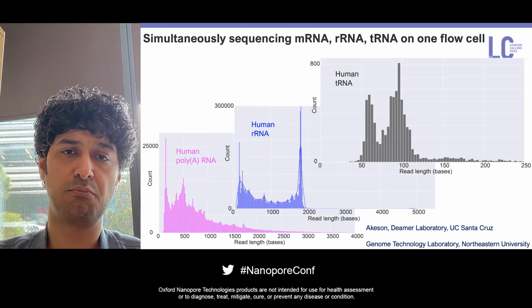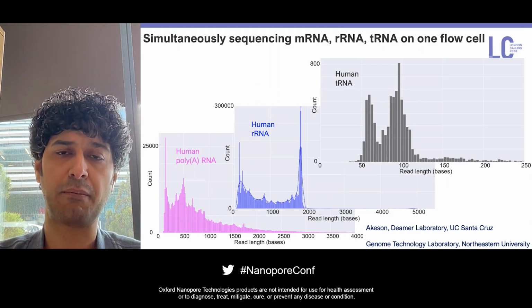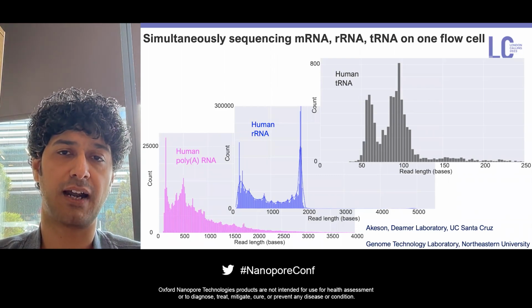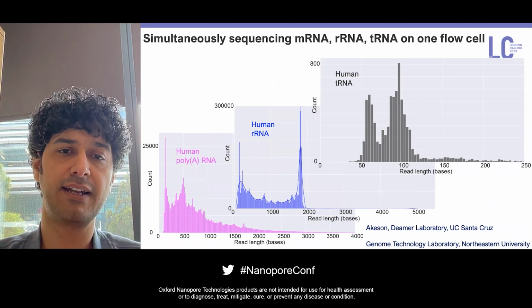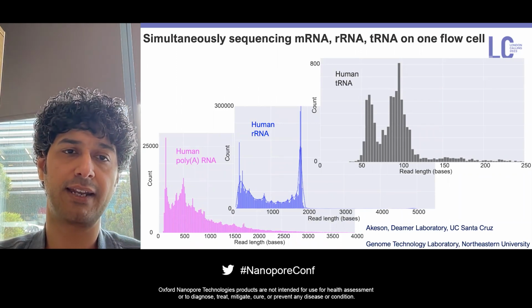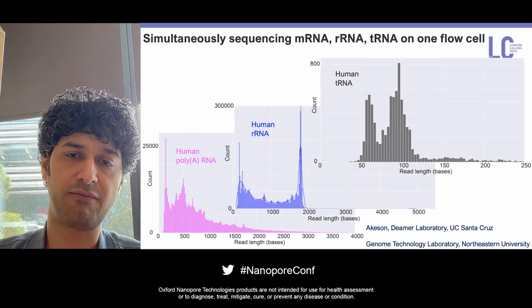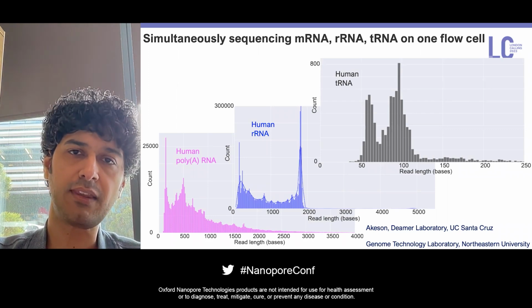And this is both exciting and very powerful because this opens a whole range of applications, because imagine being able to do this from a microgram or two of starting total RNA material. And that's both a significantly lower input requirement and also a significantly improved output in terms of the throughput that you'll get and the inference you can make. To give you an idea of what this kind of data processing can do and what the improvement is, here's an example.